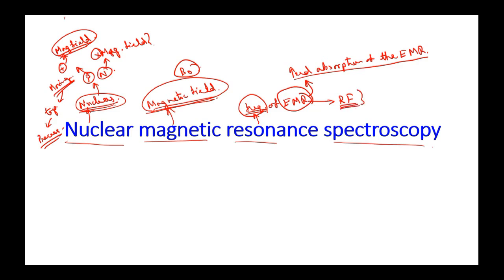So radio frequency waves are used as the EMR, electromagnetic radiations.